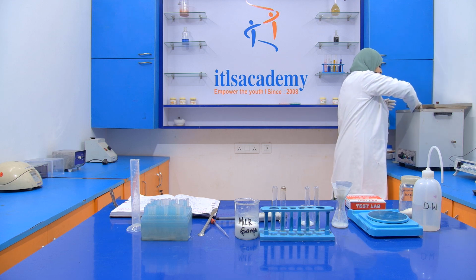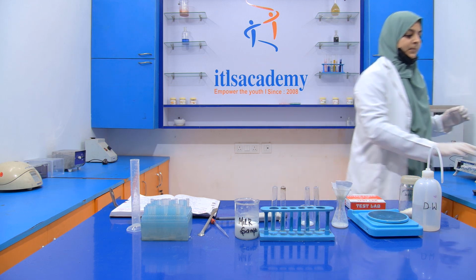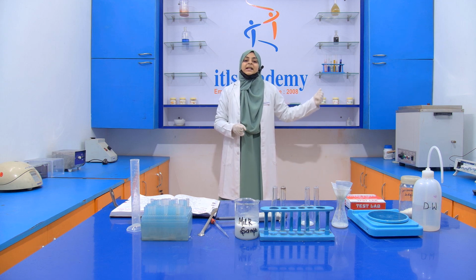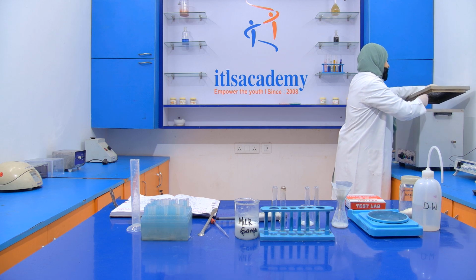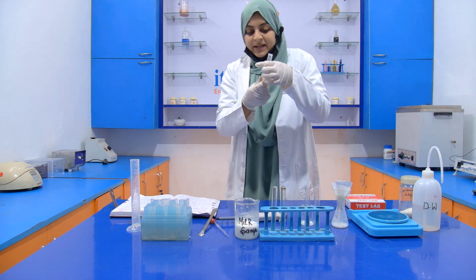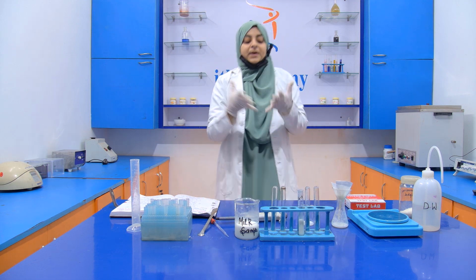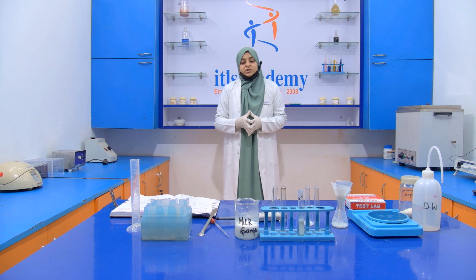After 5 minutes, I will take out this test tube from the water bath. Now after 5 minutes, I am going to take out this test tube from the water bath and see the result. Now you can see that there is no turbidity appearing in our milk sample, which means that the milk is properly sterilized. So this is all about the detection of turbidity for checking sterilization.